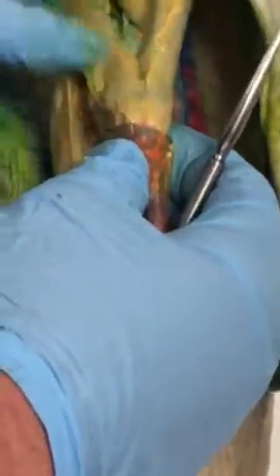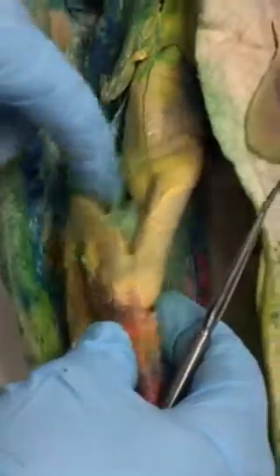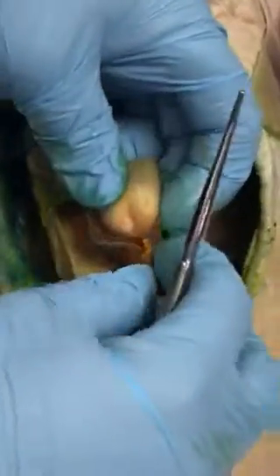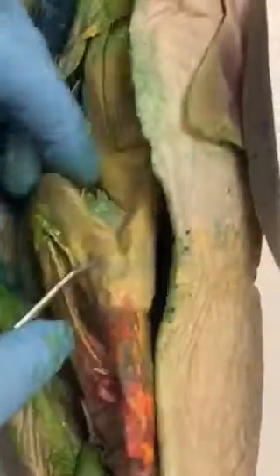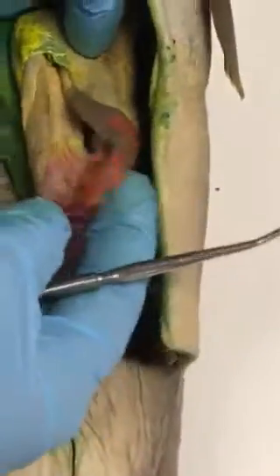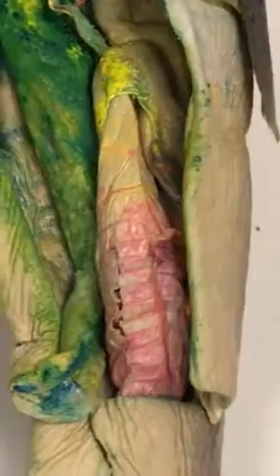Okay. See, here's the stomach, and then immediately off the stomach is the duodenum. It's a really thick duodenum. You can actually see the line, the pyloric sphincter right there, and then immediately it becomes the duodenum. What's this thing? That's the spleen. Spleen. Okay.